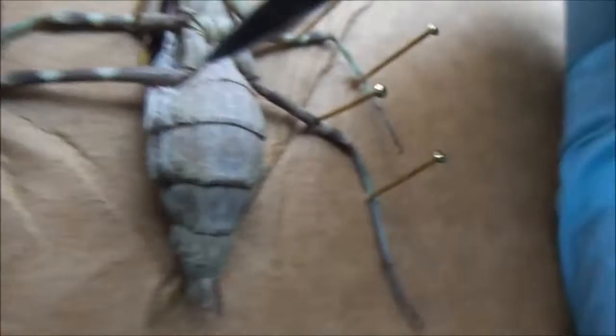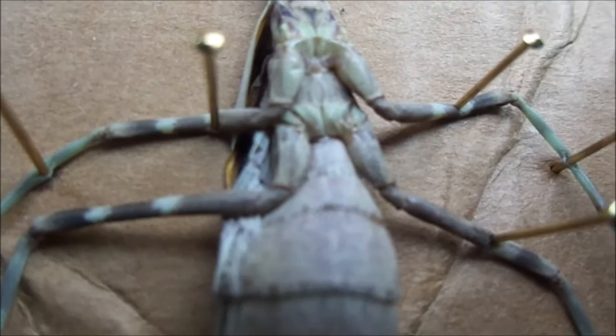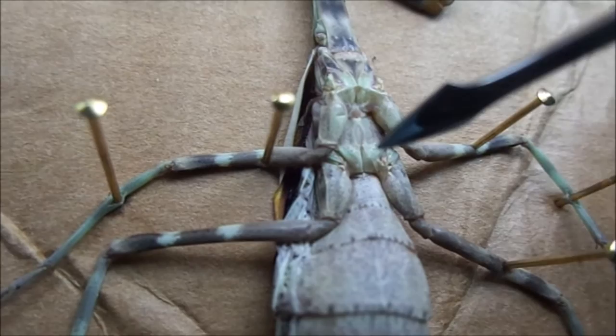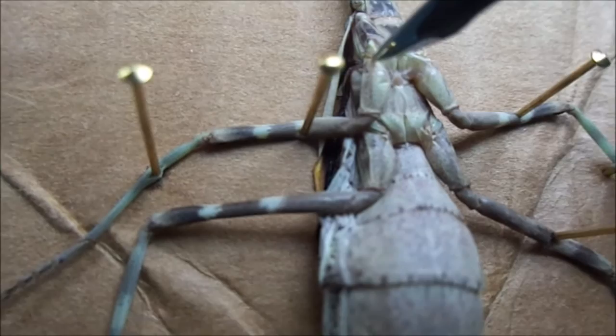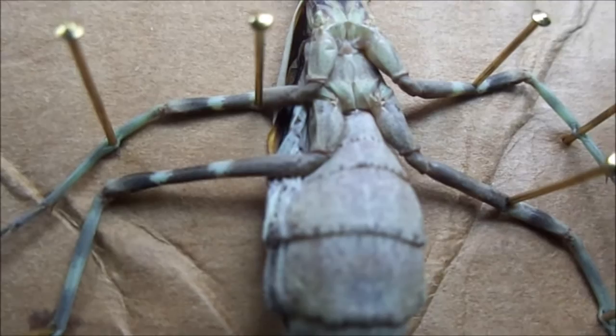Insects breathe through the tracheal system, which means there's a huge surface for gas exchange so oxygen can get into the tissues. Mantises also have — I can't remember if it's four or six — these things called auxiliary hearts, which basically just pump fluid all through the body. They don't have a dedicated organ like mammals do.